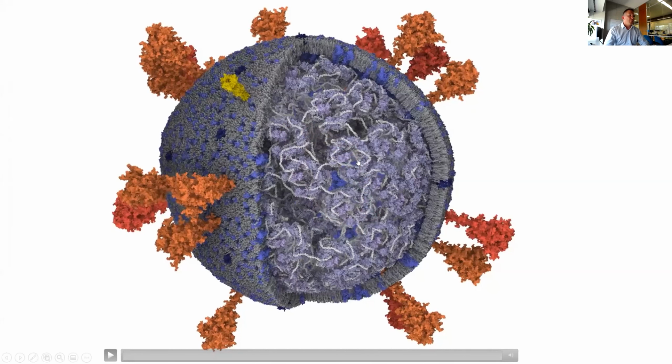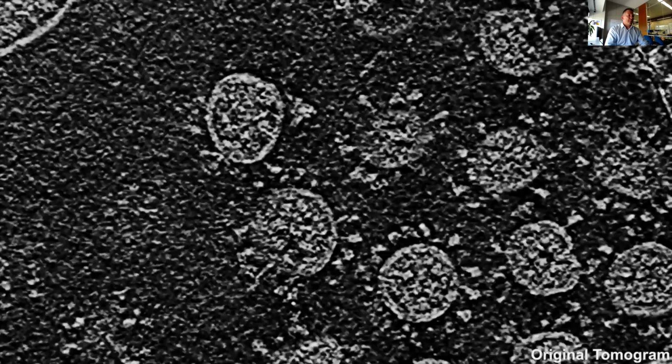So we have started to collaborate with Sai Li, and that was also the basis for generation of various videos of this virus, which you have seen both in terms of atomistic model, but also of the volume rendering of the specimen, which Sai Li has imaged and then kindly provided to us. You can see how such a specimen looks like after tomographic reconstruction, and also after several image processing operations. You can see that clearly some structure, some specimen is recognizable there.